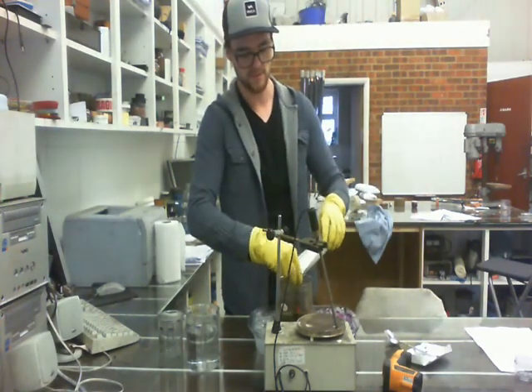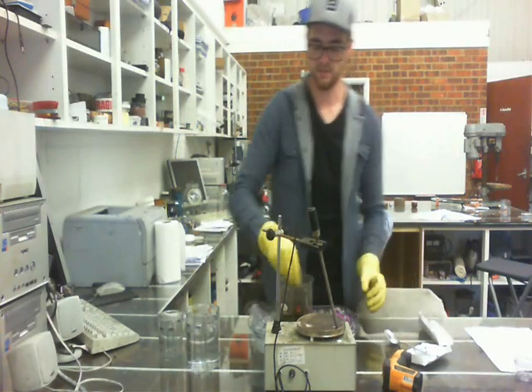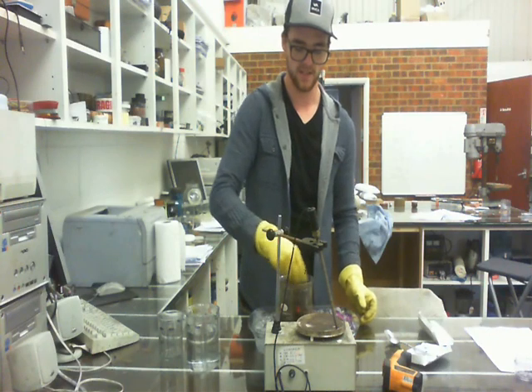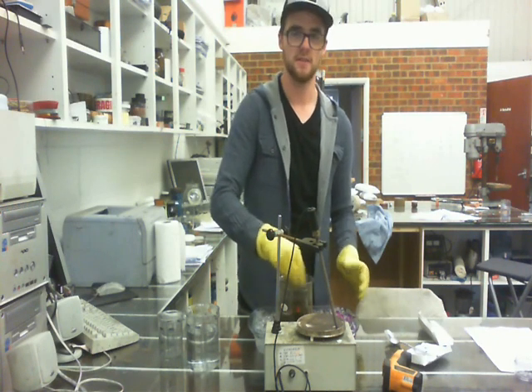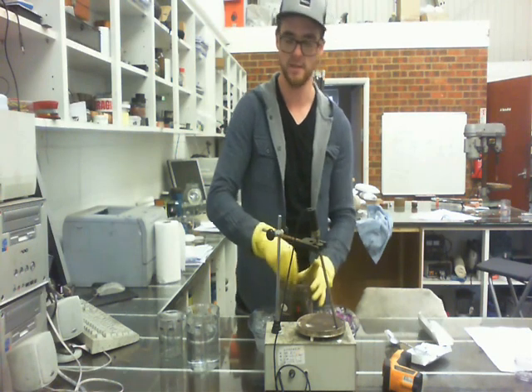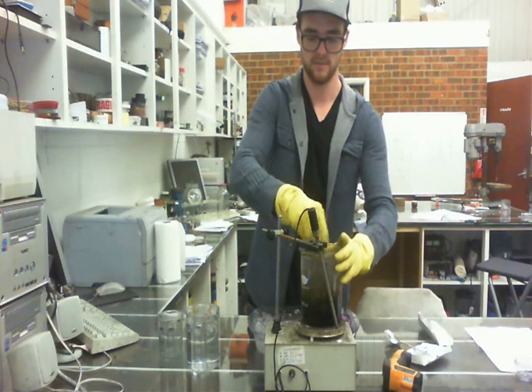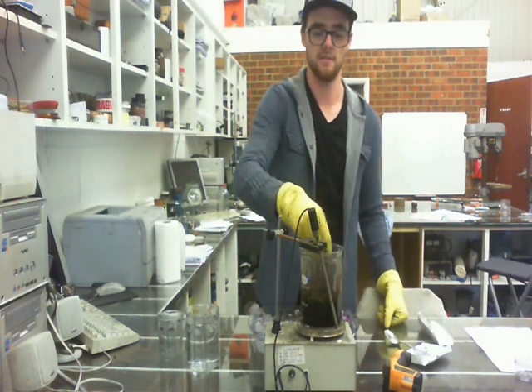I'm going to add the last bit here, still stirring. You can feel it kind of thickening. Now all we need to do is heat it up to about 35 degrees, and that's where this heater here comes in. When you put it on there, it's going to sizzle a little bit, but that's just because it's wet — you don't need to worry about it. We're going to continue stirring this for about another half an hour at 35 degrees.